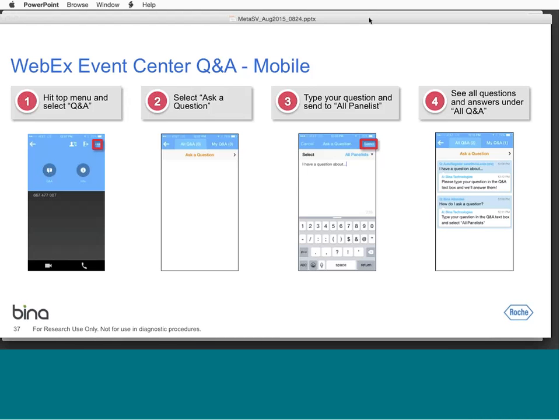Another question is, have you done any joint SV calling using MetaSV? Unfortunately, MetaSV doesn't do any joint calling. It works only for single samples. Those single samples have to be called using different SV calling tools.